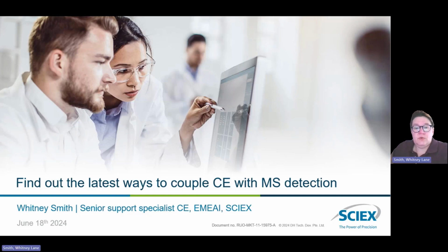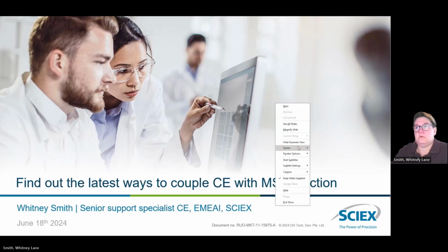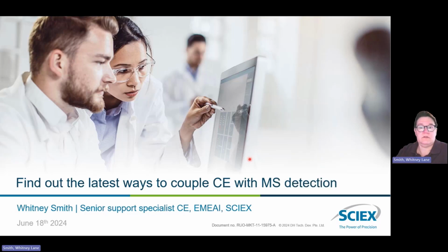So my name is Whitney Smith. I am a senior support specialist here in EMEA, located in Germany, and I am responsible for CE and CEMS, which is what we're going to talk about today, the latest ways to couple the CE system or a CE system with a mass spec. Let me turn on my laser pointer so that we can all see everything.